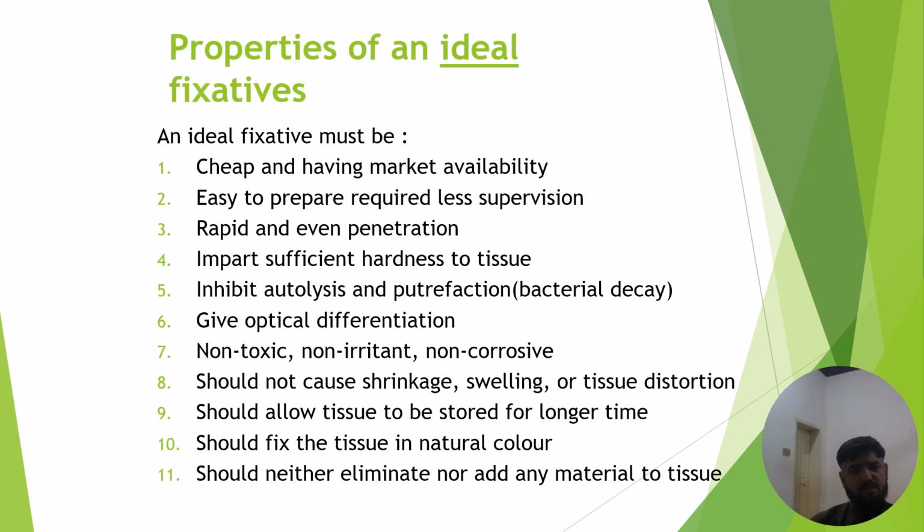So what we assume should be the properties of an ideal fixative. The ideal fixative is the one which should be cheap and having market availability. It must be easy to prepare, require less supervision. It must be rapid and having even penetration. It imparts sufficient hardness to the tissue. An ideal fixative must inhibit autolysis and putrefaction effectively. It must give the tissue an optical differentiation.